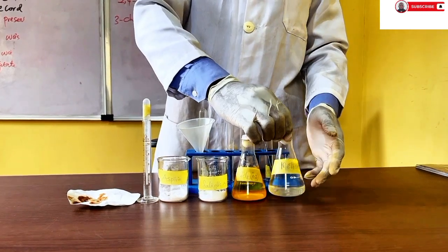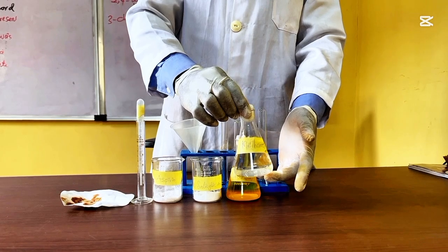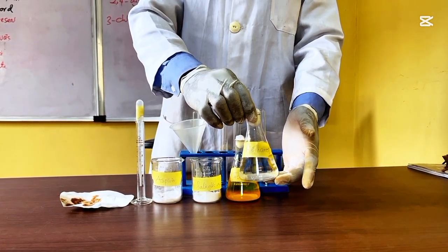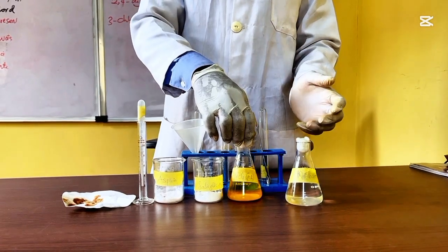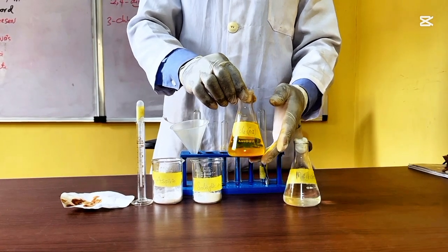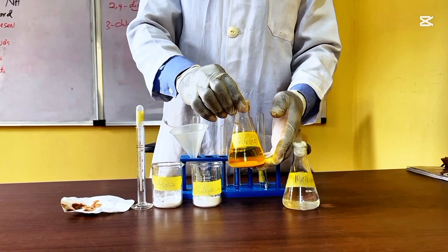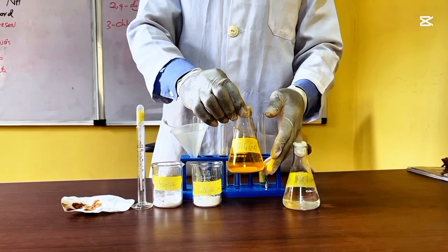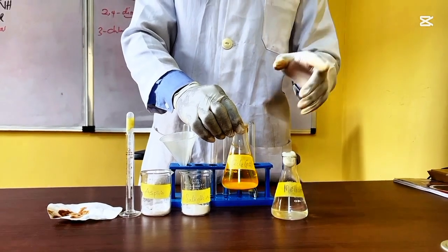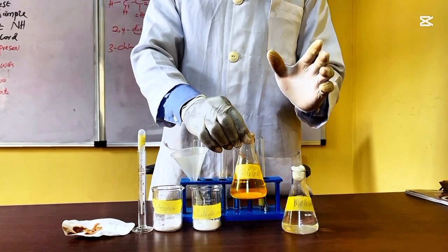For your reagent, you have methanol. And why the choice of methanol? Methanol helps in dissolving the samples without interfering in the results, or without interfering in the reaction. You have ferric chloride, and this is 10%. Ferric chloride reacts with phenol, and it helps to identify the presence of phenol that is present in salicylic acid, and we can detect that by a color change. It can be a violet color or purple color.